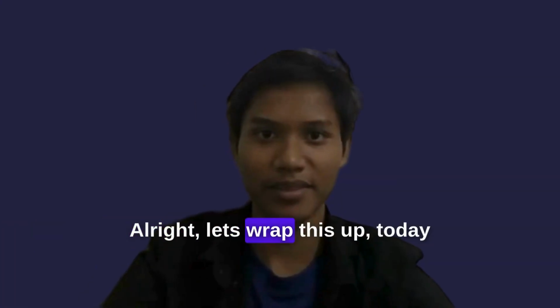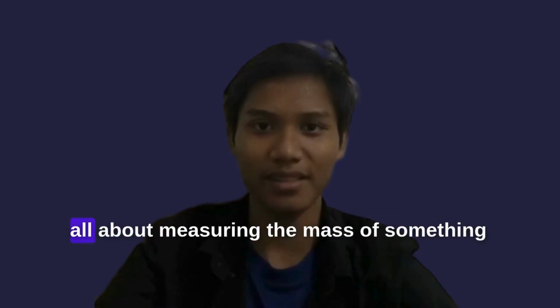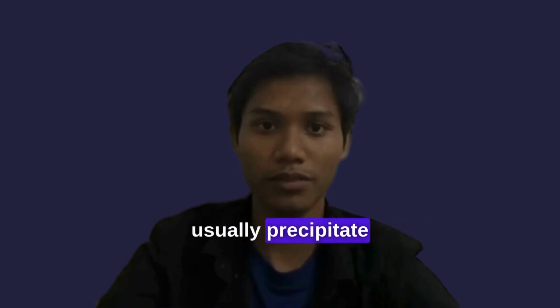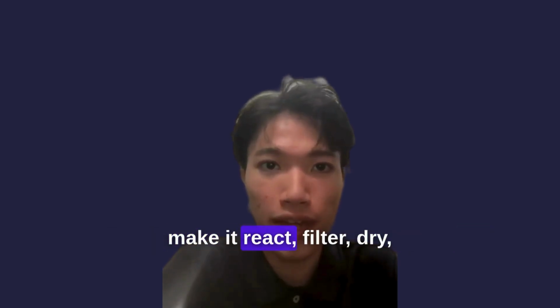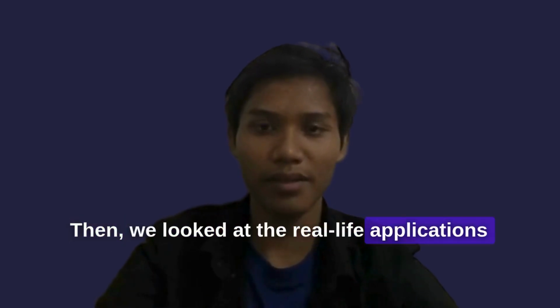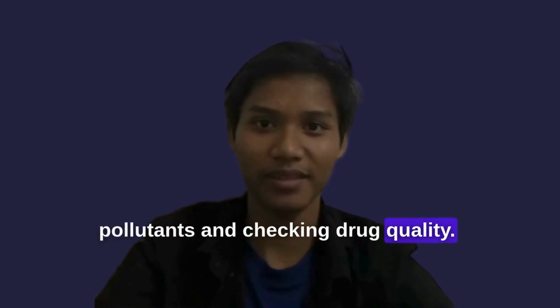Alright, let's wrap this up. Today we learned that gravimetric analysis is basically all about measuring the mass of something after we've converted it into a solid form, usually a precipitate. We walked through the process: prepare the sample, make it react, filter, dry, and weigh, but you gotta be precise. Then, we looked at the real-life applications from testing milk and cement to detecting pollutants and checking drug quality.